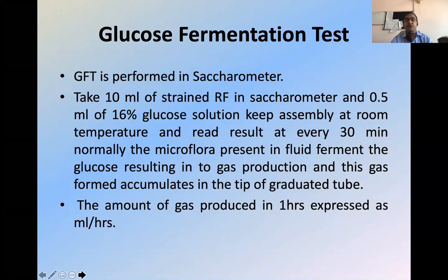Normally, the microflora present in the fluid ferment the glucose, resulting in gas production, and this gas accumulates at the tip of the graduated tube. I don't think we have all these things here, so I will contact a nutrition person about how they go for this type of test. Or I think you might have seen this test in the Department of Nutrition.